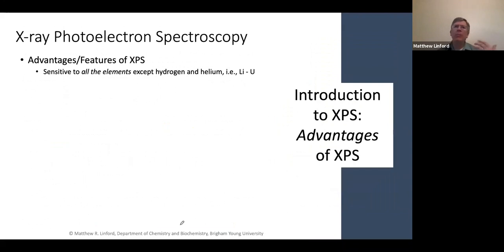Before we go into a few more details about XPS, I did want to say, what are some of the advantages and some additional features of XPS? So here's a list of advantages.